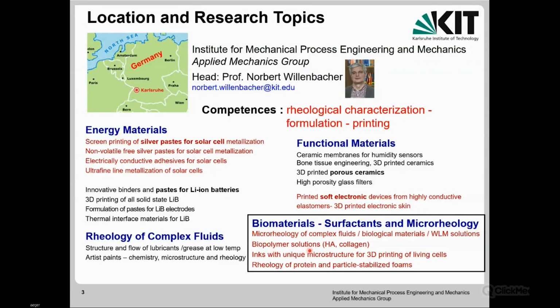And basically, with these materials, we are performing rheological measurements, but also microrheology measurements. And the topic of the day will focus on this one microrheology technique, that is DWS. And I will show you again for the different systems investigated which information we can obtain from such kinds of measurements.